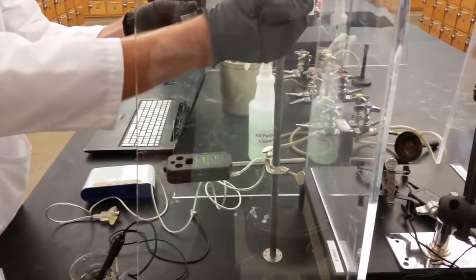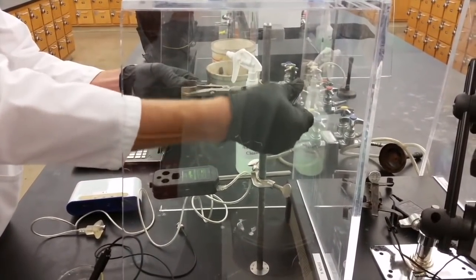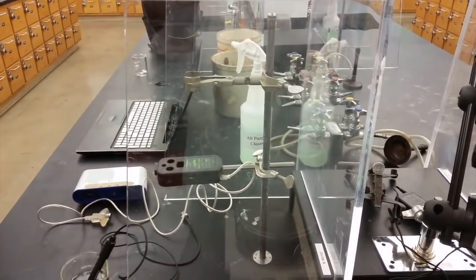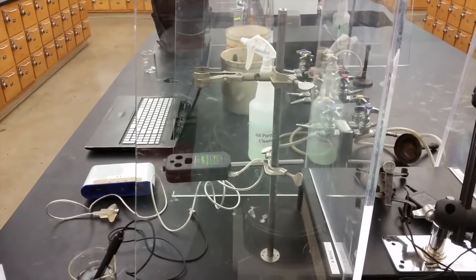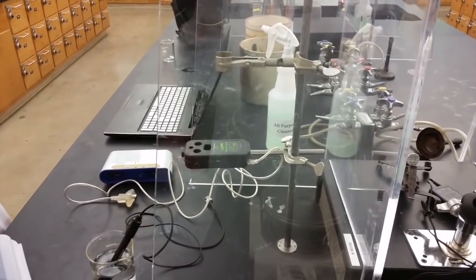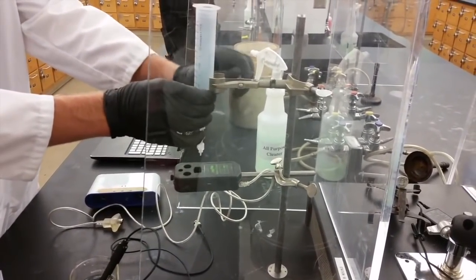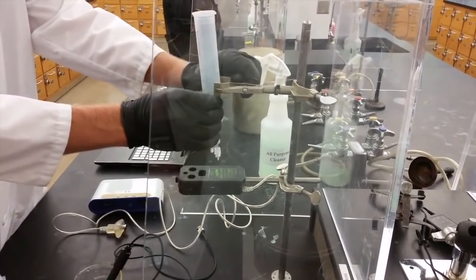You should also have a utility clamp which looks like this already attached to your ring stand. If you're missing one look around the room to find an extra or ask your TA for help. You'll use the utility clamp to attach the assembled drop dispenser to the ring stand making sure to place it above the drop counter.